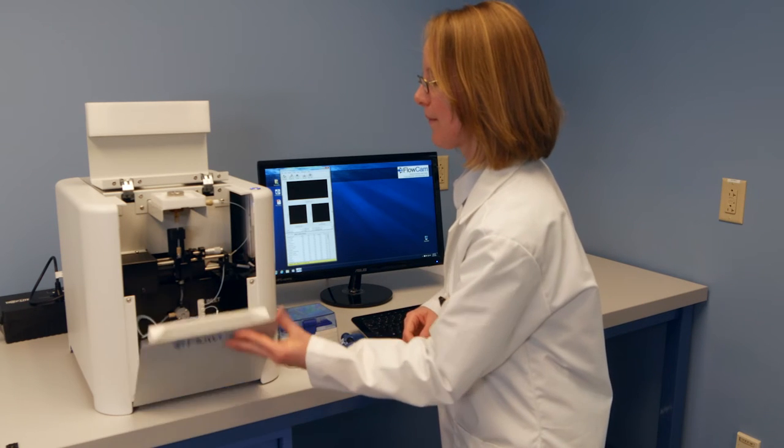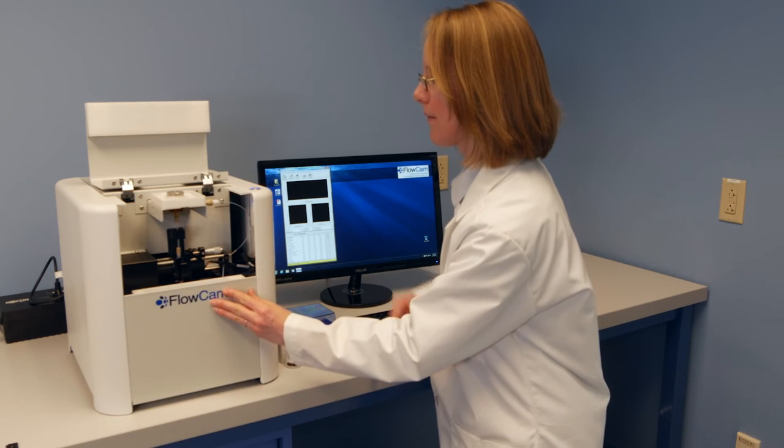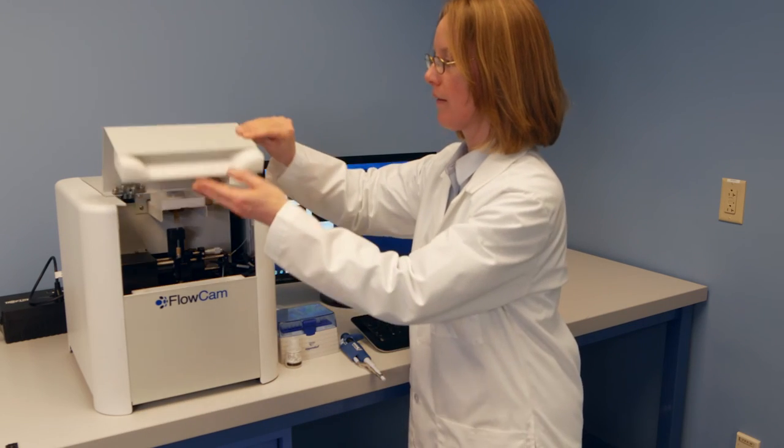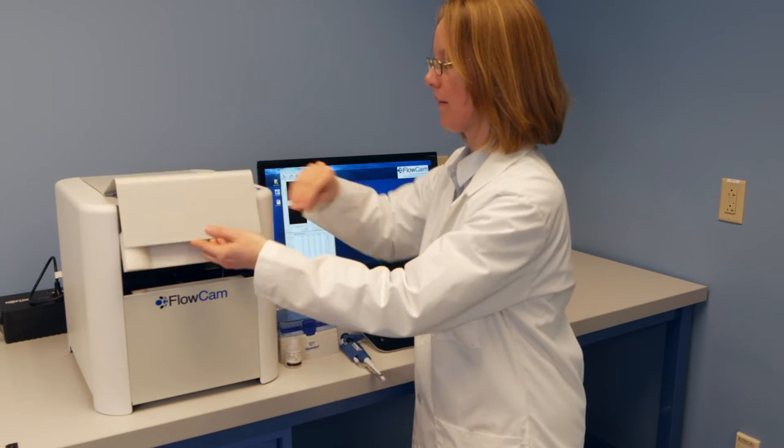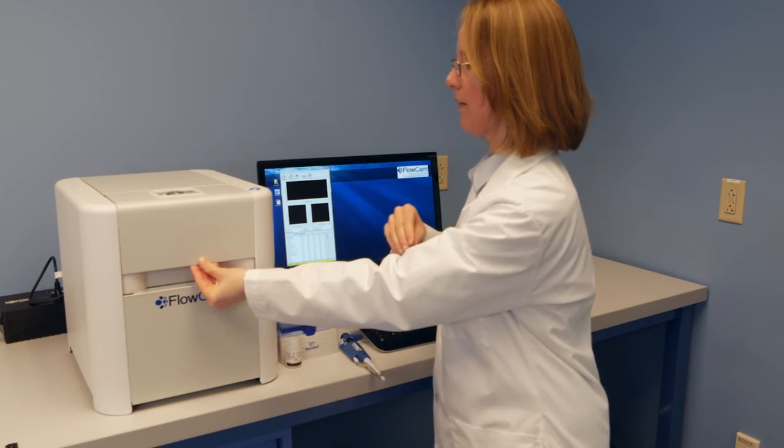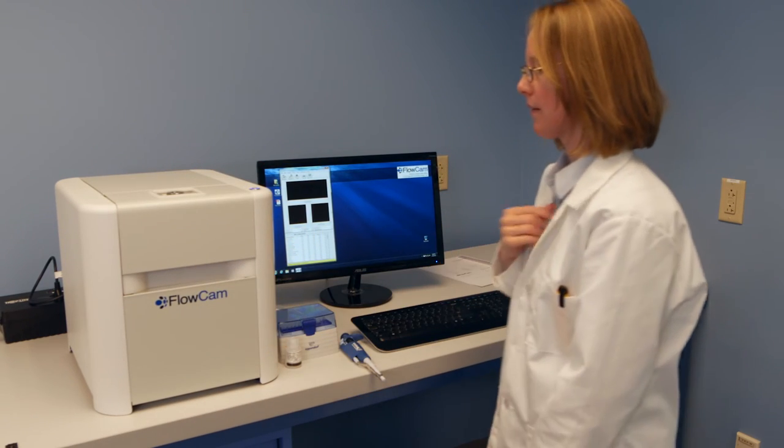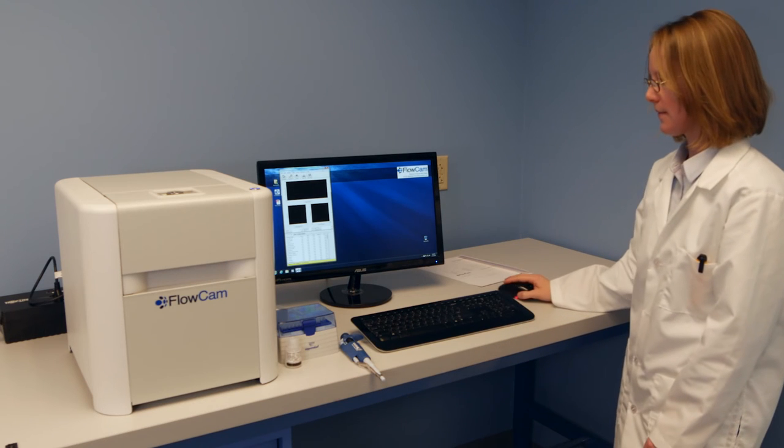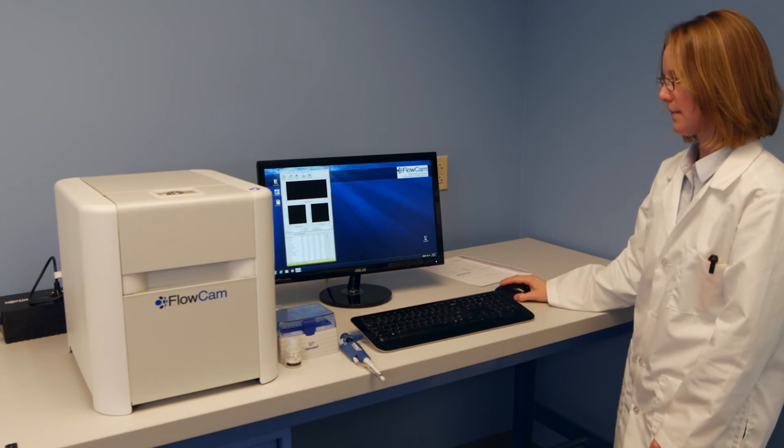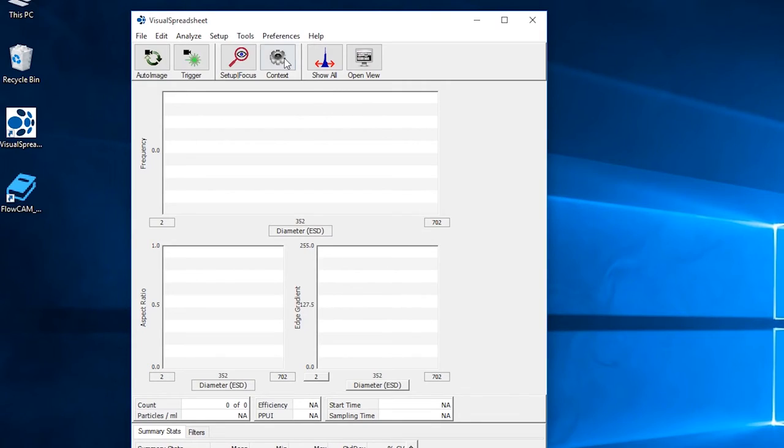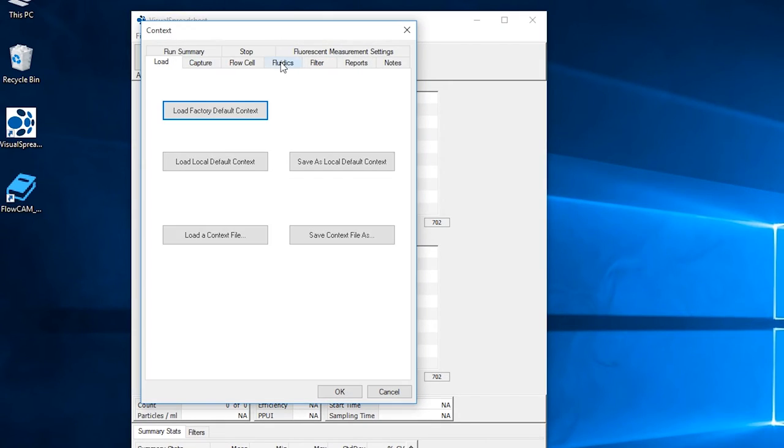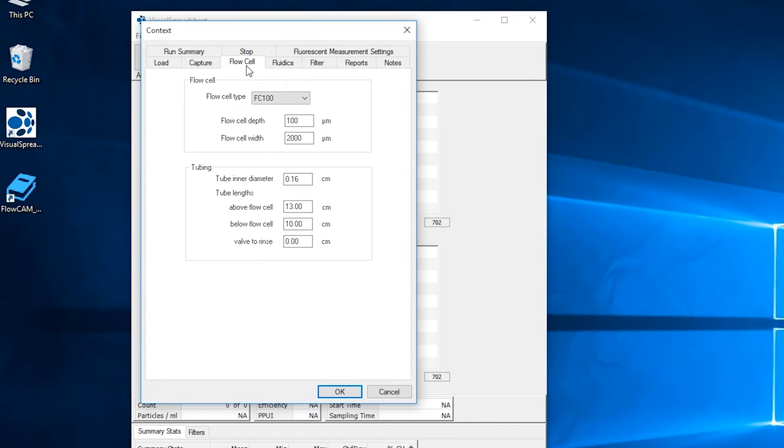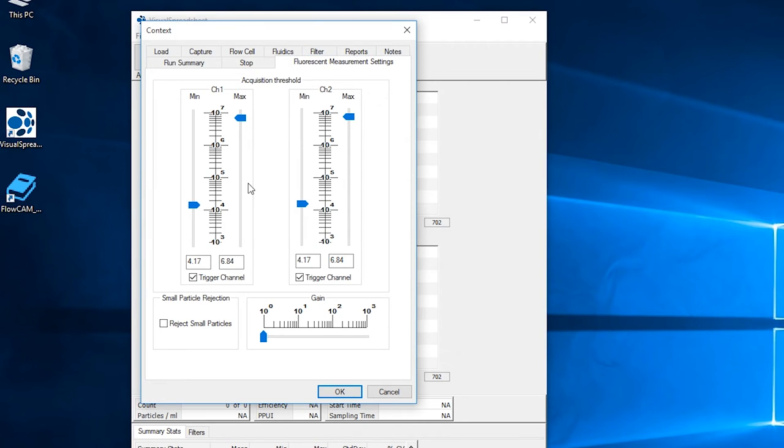Now that the FlowCam 8100 is focused and rinsed, you are ready to analyze your first sample. Before starting, set your context settings, which are the acquisition settings of the FlowCam 8100. Please refer to the FlowCam manual or the context settings video for further explanation on each of these settings.